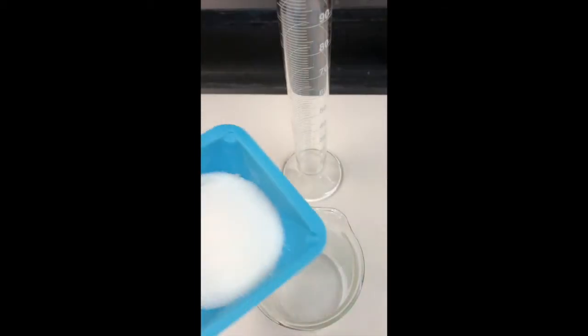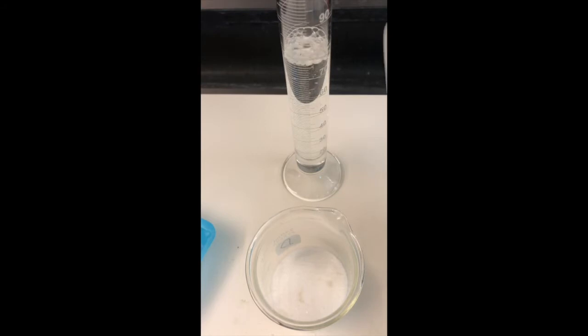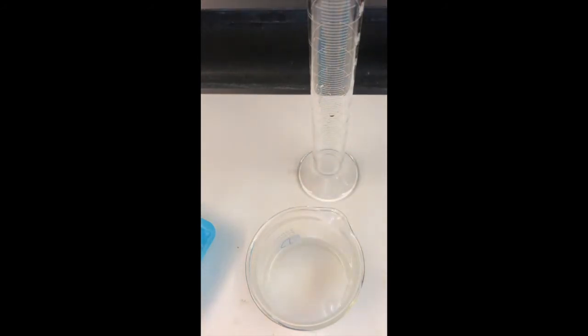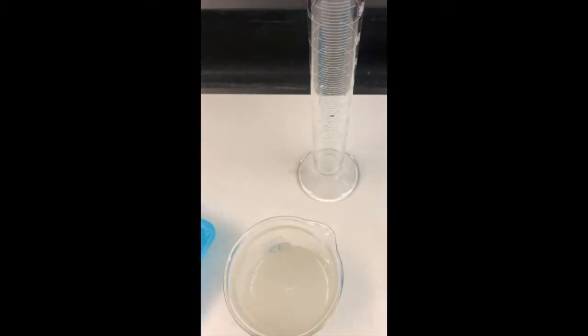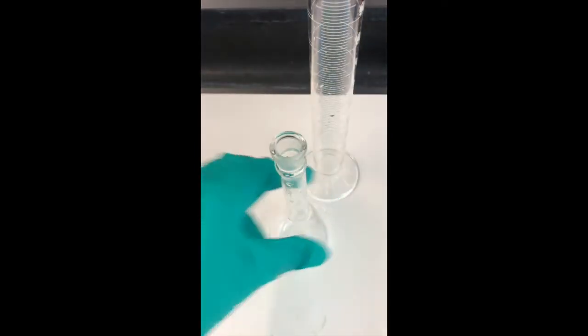Step two involves transferring your sugar to a 250 milliliter beaker and adding 80 milliliters of water to dissolve it. Use a graduated cylinder when measuring out the 80 mils, as a beaker is not appropriate for measuring volume. You're going to want to use a glass stirring rod to stir your sugar into solution. Once your sugar is in solution, you're going to want to transfer it into a 100 milliliter volumetric flask.